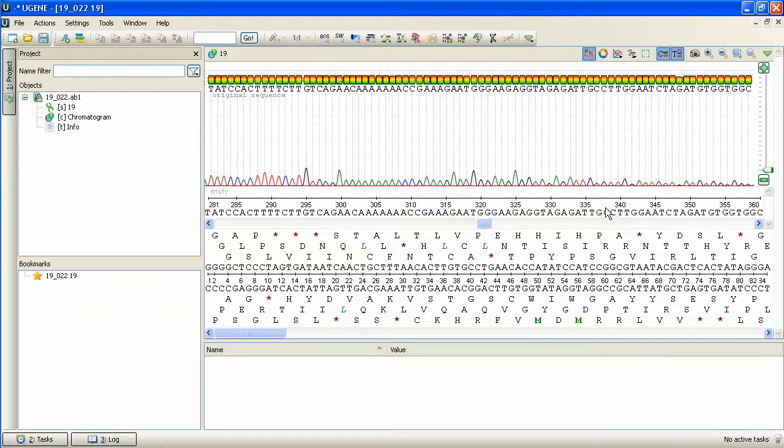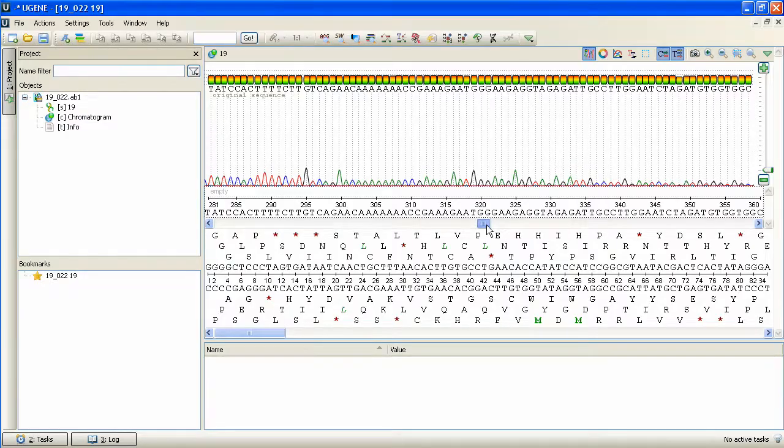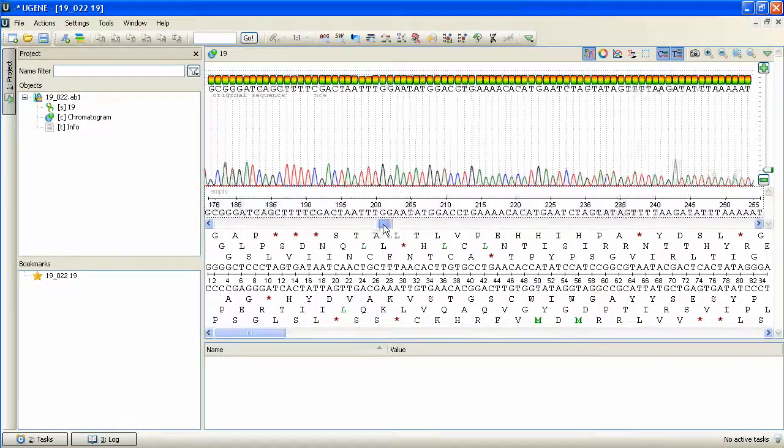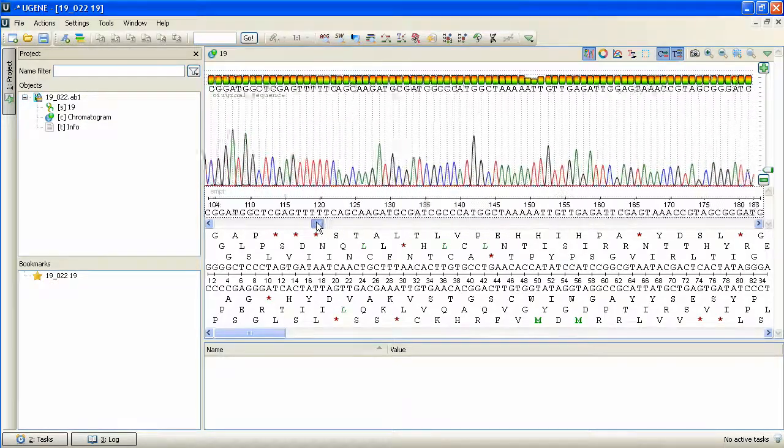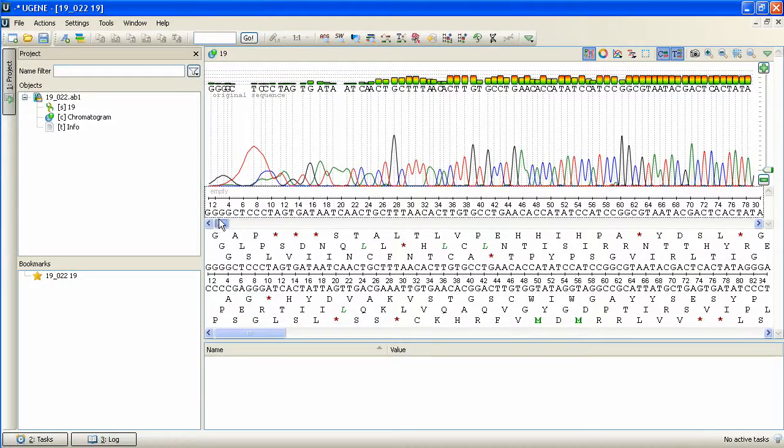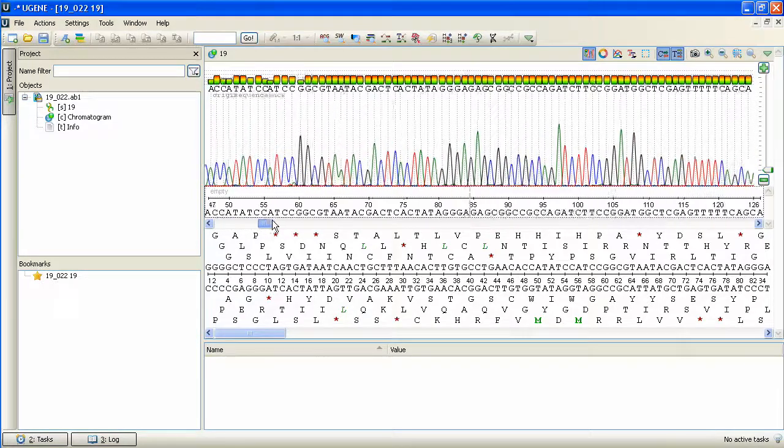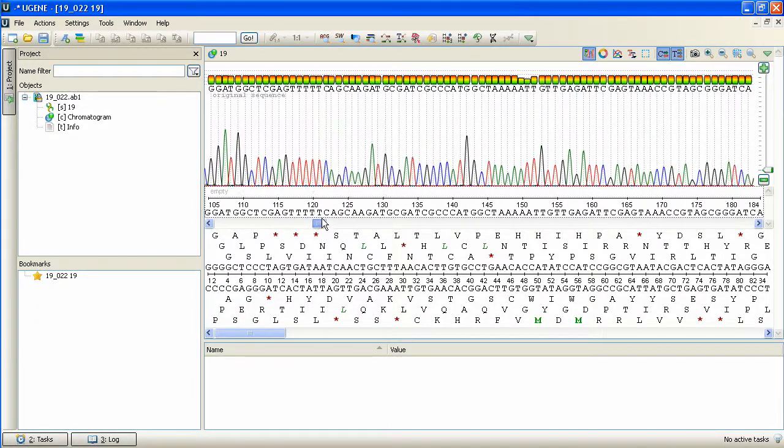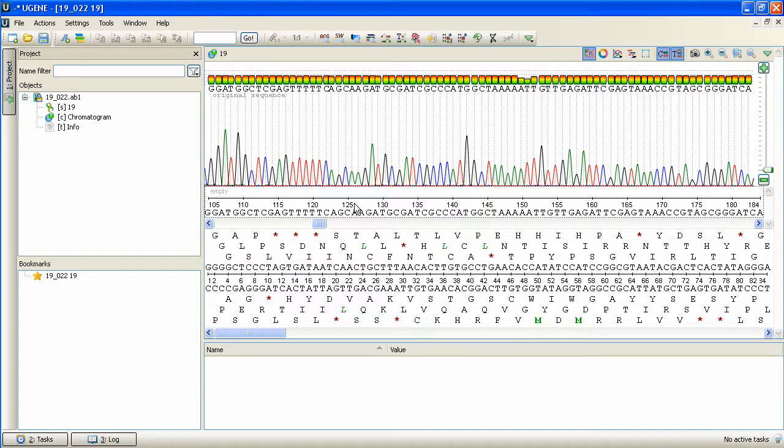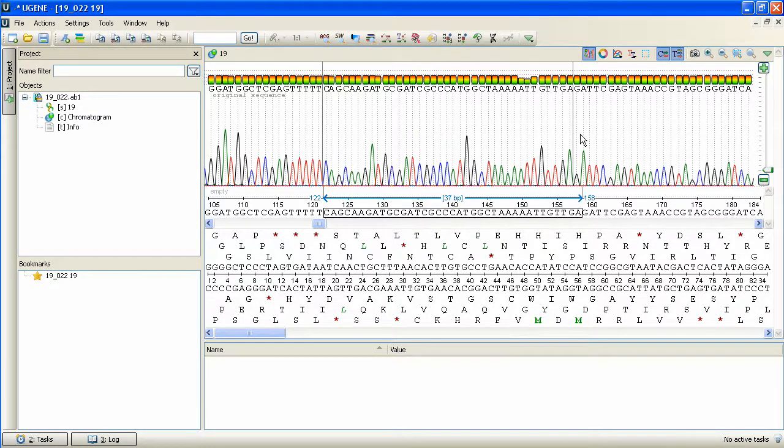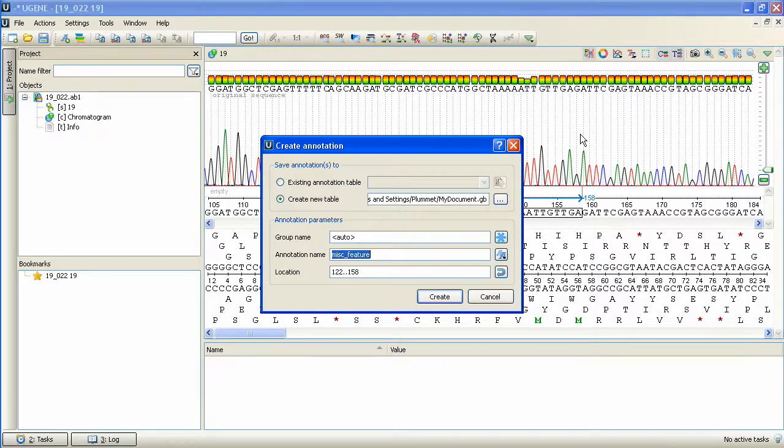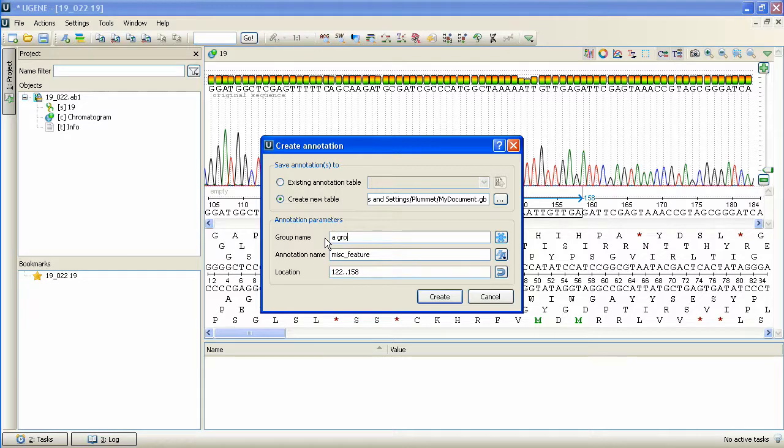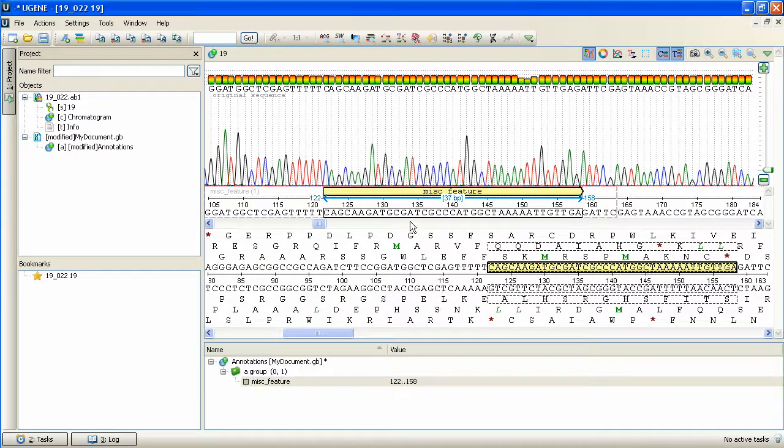If we now move the zoom region by dragging the panoramic view scale slider, the chromatogram zoom region is changed correspondingly. Thus, the panoramic and the chromatogram views are connected, so we can still add an annotation to a selected sequence region and therefore annotate a chromatogram region.